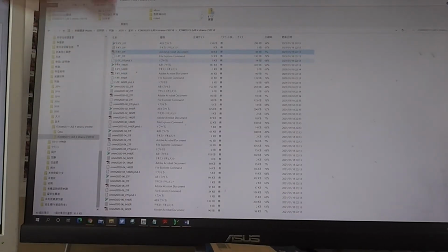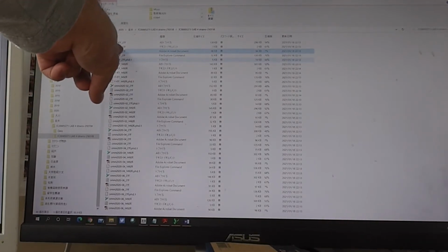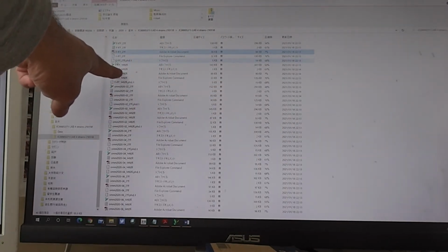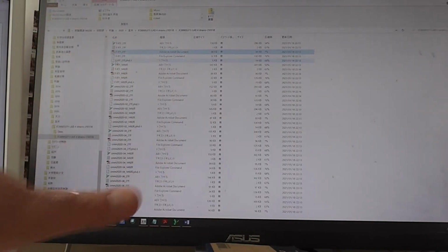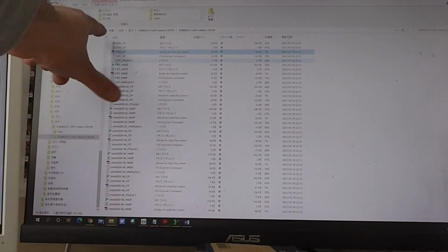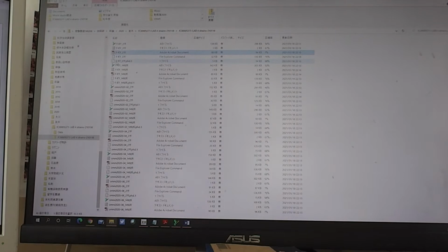About this strain, we need to get two sequences. We use the forward primer, in that case 27F, which means the forward primer. But another one is here, 1492R, which means the reverse primer. By using the two sequences, we can construct the full length of the 16S rDNA.